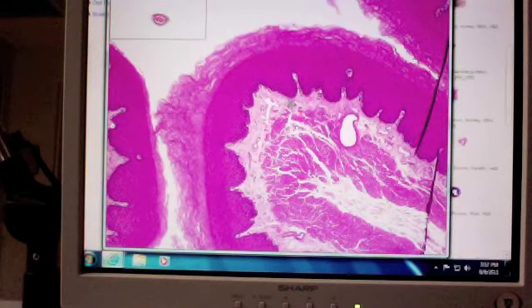So I could say here, the top of this arrow is pointing to what structure? What structure? Loose connective tissue is a tissue, not a structure. What do you see when we're looking at this? And in this case, just to orient you, this is going to go all the way down here. There's a structure sitting here. What is that structure? Anyone? Basement membrane. Okay?